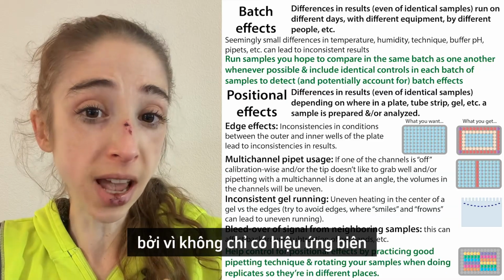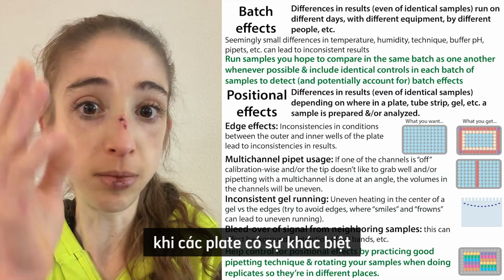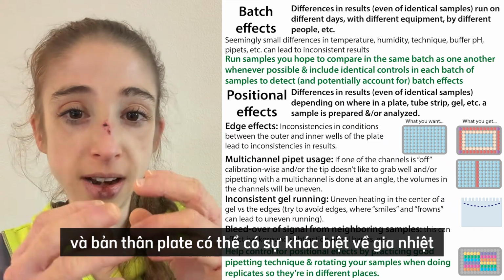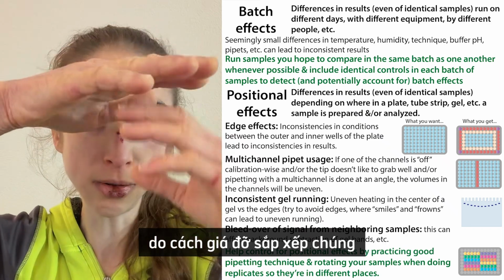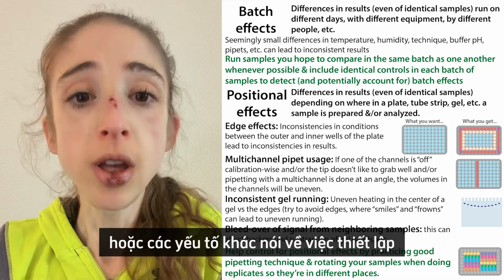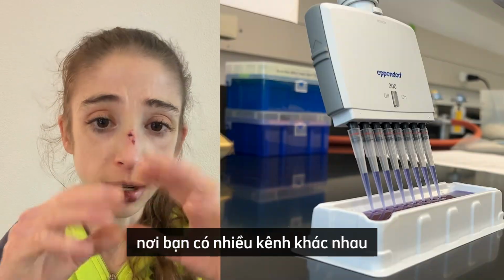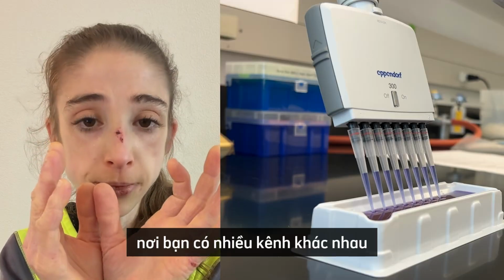Because not only can there be edge effects, but there could also be other position effects, where differences in the plate just kind of have differences in heating due to how the holder is set up. Speaking of setting up, you're often going to be setting up these experiments using something like a multi-channel pipette, where you've got a bunch of different channels.